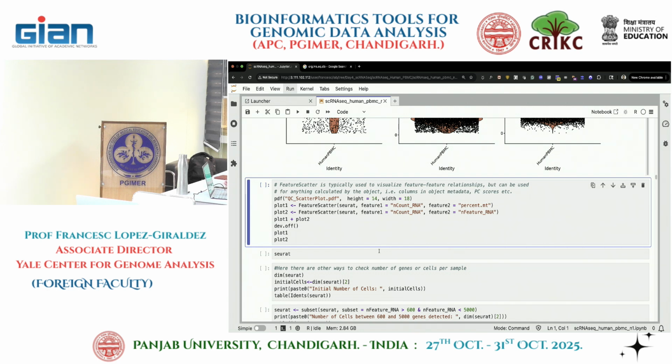Okay, the problem is this is an issue with R. The errors they give are quite useless because it looks like the error is here, but it's not true. The error may come from earlier, and I don't see it. Let me start removing lines that are not important, just to be sure that I don't miss anything. Okay, the error still exists.